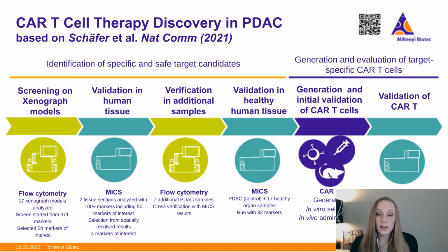And so again, I like to end with how all this comes together: being able to use all the markers that you can automatically image, and then also the software to automatically detect individual cells and make some conclusions out of it. The example is CAR T cell therapy in PDAC, or pancreatic ductal adenocarcinoma. This particular paper was part of a larger workflow of engaging a lot of automated devices to really start identifying a particular target of interest, so that when you get down to the generation of the CAR T, you have a few good targets to use.